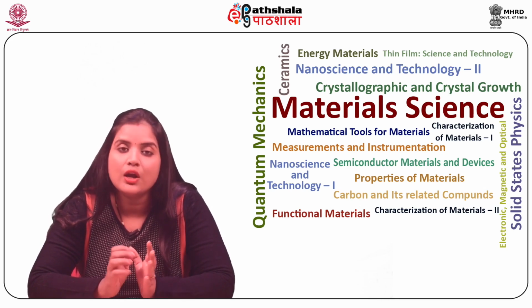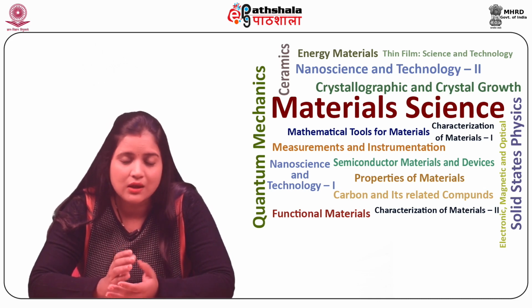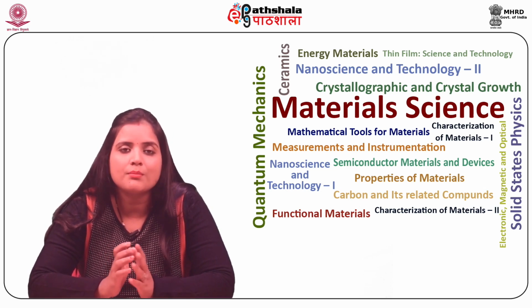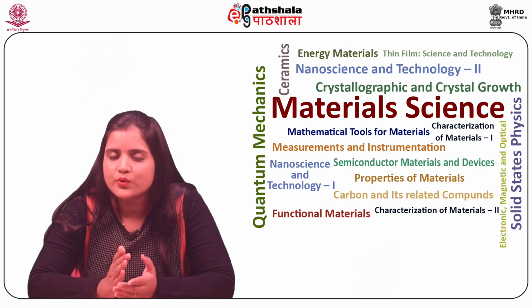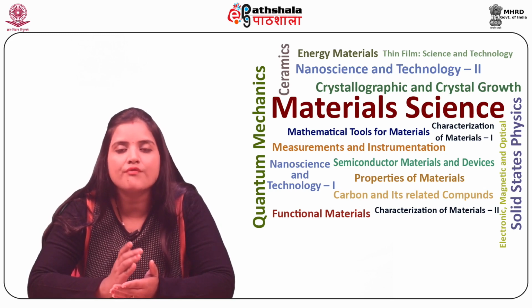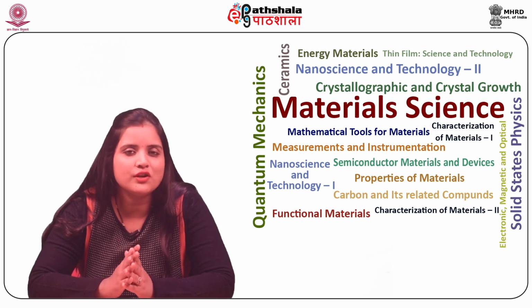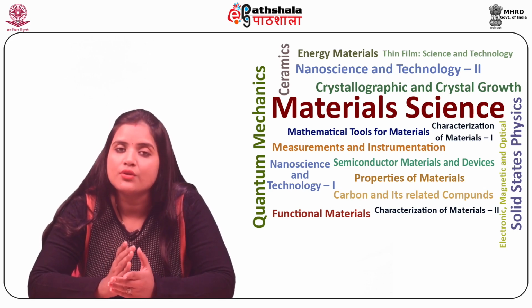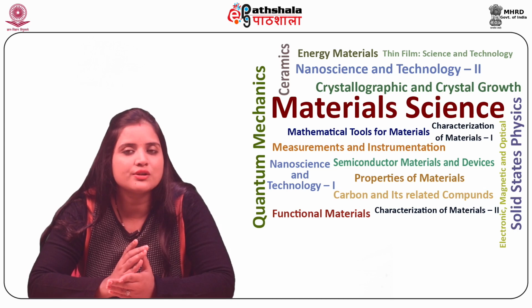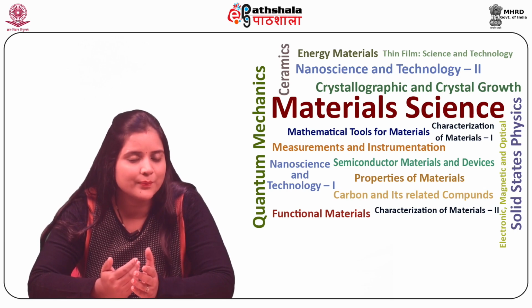Conventional holography involves creation of this field via optical methods and then recording by interferometric or other methods. However, digital holography comprises computation of associated fields and is highly complex as three-dimensional features often comprise non-planar surfaces. Thus, wave propagation simulation is fundamental to the working of digital holography.